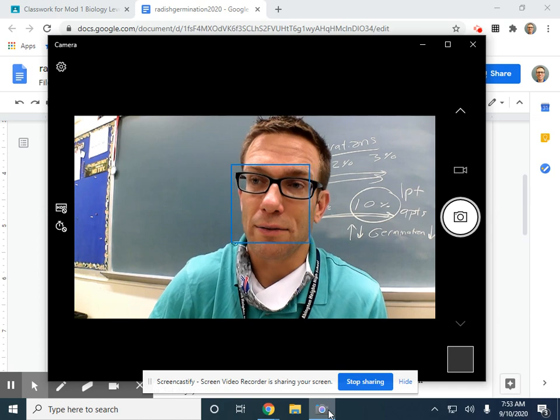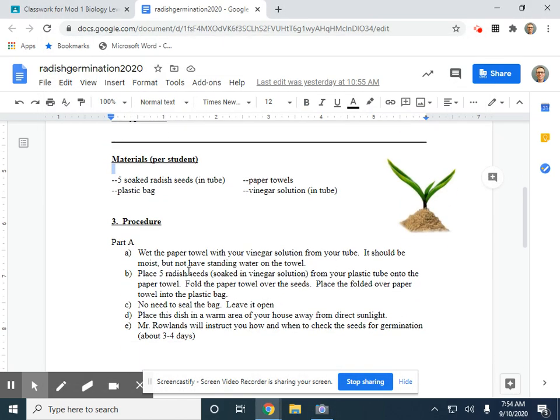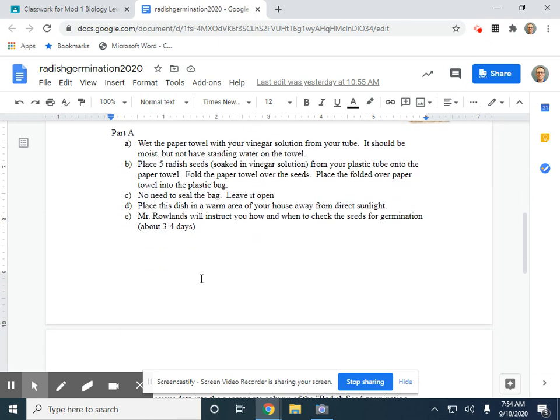Okay, I'm going to go back to my computer screen just for another minute here. So guys, we just did this procedure. And remember, like what I said on Sunday, please just add some more liquid if needed, and don't throw away your tube that has the liquid in it. I mean, you could put it inside the bag if you want everything in one spot. As long as you have the cap on, it's not going to leak.